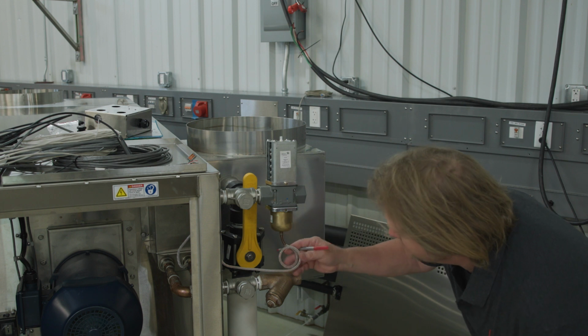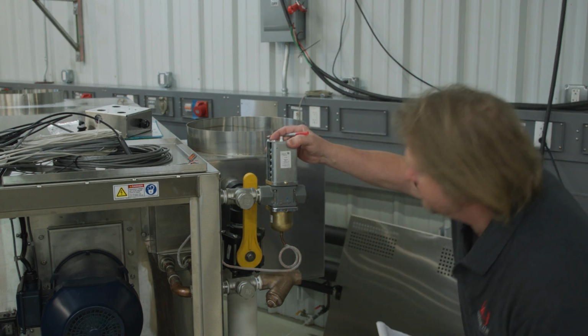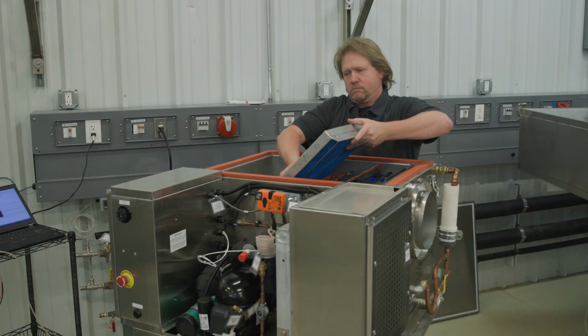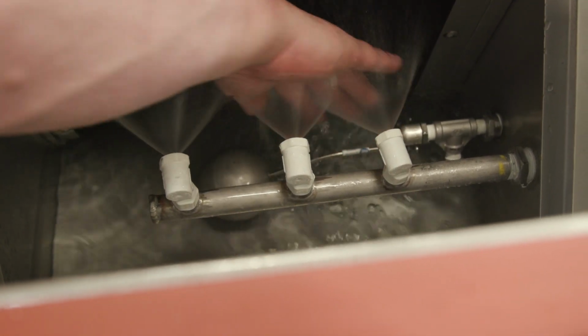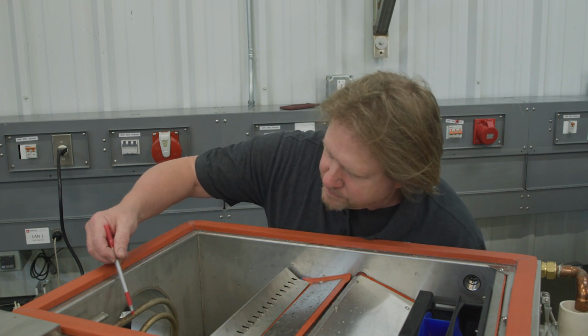Inspect the condenser flow valve for any rust or corrosion. Verify that the water spray nozzles are spraying uniformly. Inspect the air and water heaters for surface corrosion.